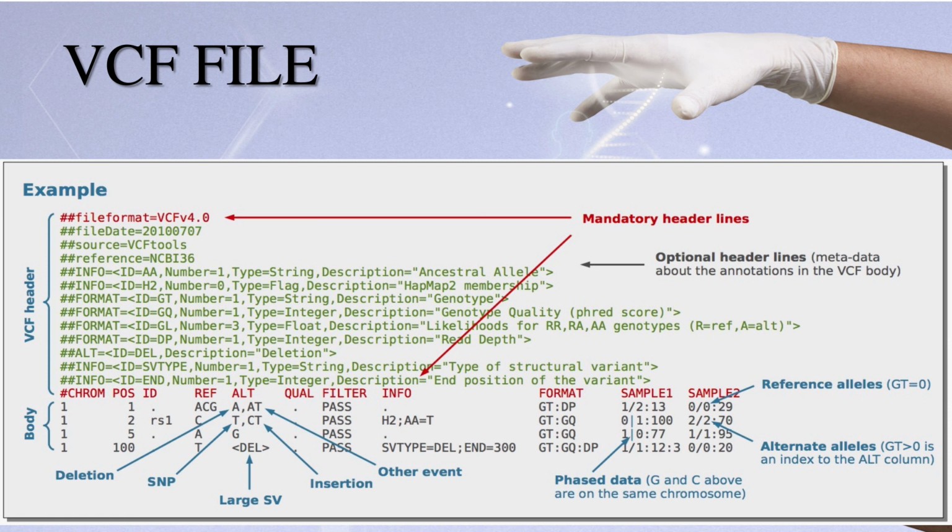If the distinction between lines starting with INFO, FILTER, and FORMAT is not immediately apparent, clarity is expected to emerge as we progress to discussing the records in the VCF file. This subsequent discussion will expound upon the details regarding variants and the information pertinent to both variants and samples. During this phase, numerous annotations will be addressed, enhancing comprehension of the delineated distinction.